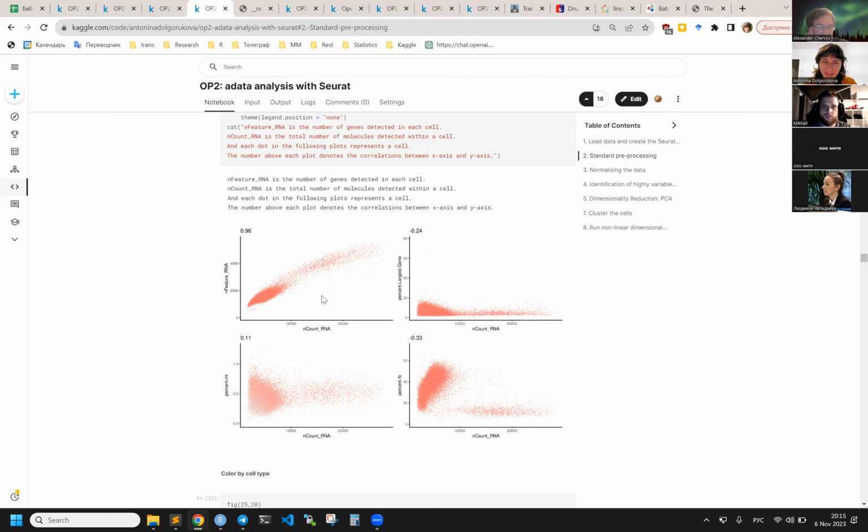Right, because this data is very, very strange. I have made a lot of different strange observations, like some data comes from just one cell sometimes, and there is no data for negative control sometimes, and it's not clear how they pre-process the data, or maybe I'm just stupid, couldn't figure it out using all the descriptions and discussions. It's still not clear how they subtracted the effects of negative control to calculate aggregated data.